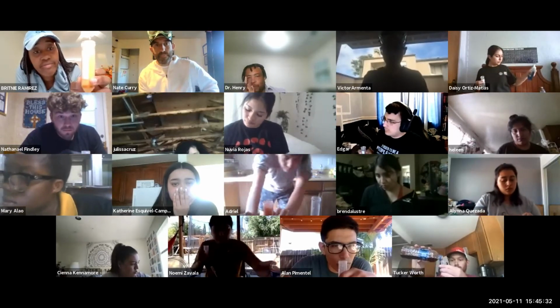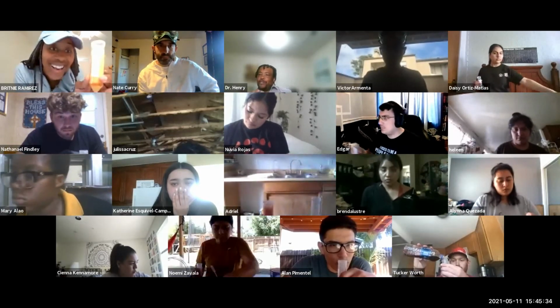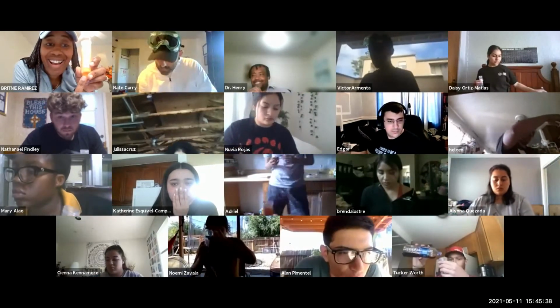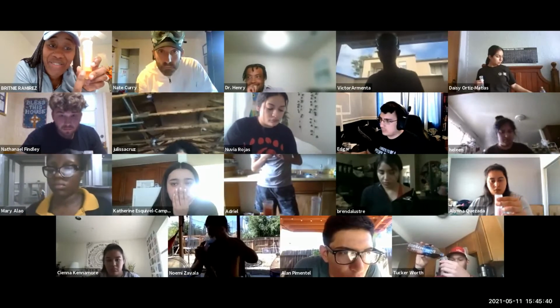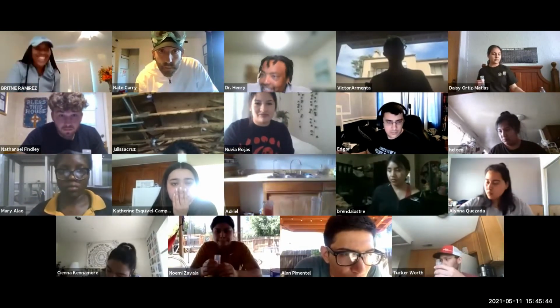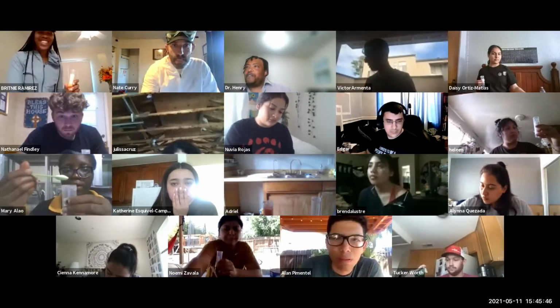Okay, I would do it one more time. That third time, that'll be the third time. First time was working out the conditions. The second time was, what's that? This is the third time. I know, do it one more time. One more. Come on, you're gonna be a good scientist. You're gonna be great after I'm done with you.